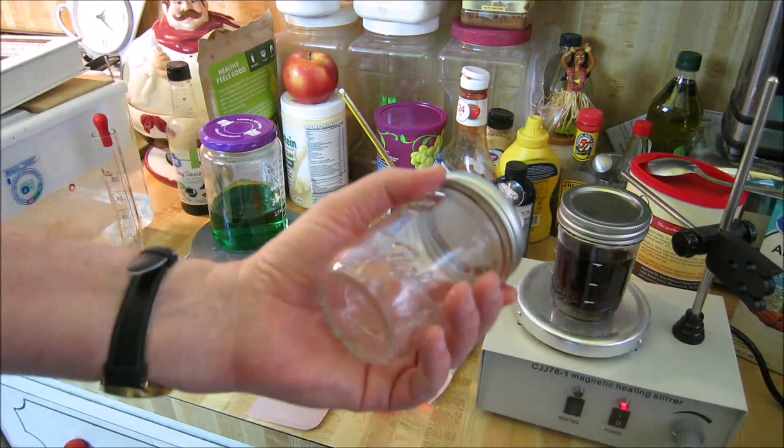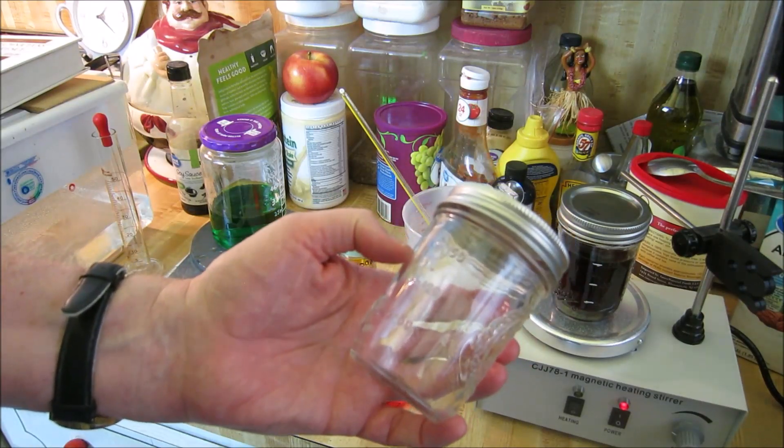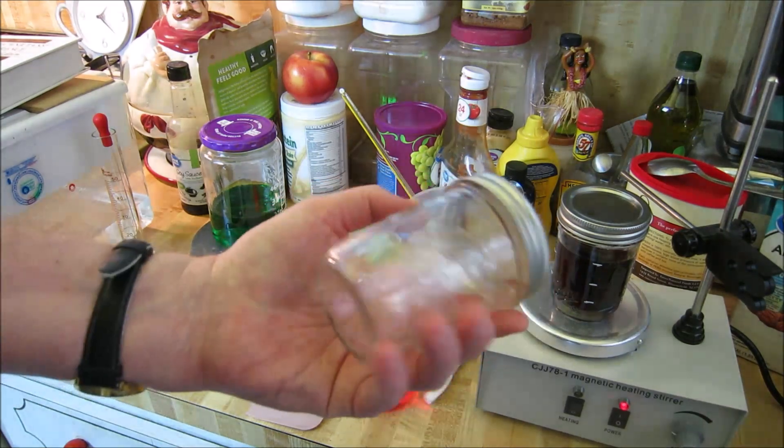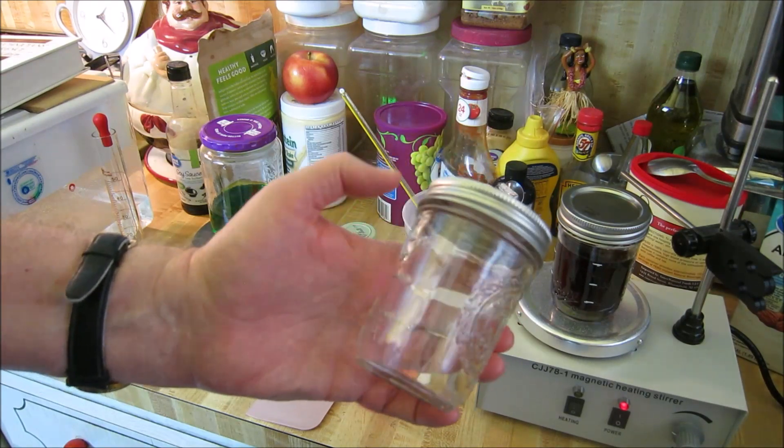So the second thing I want to talk about in the video was that I measured the volumes with the markings on the ball canning jars and they were very accurate. I was surprised. I figured they'd be off a bit.